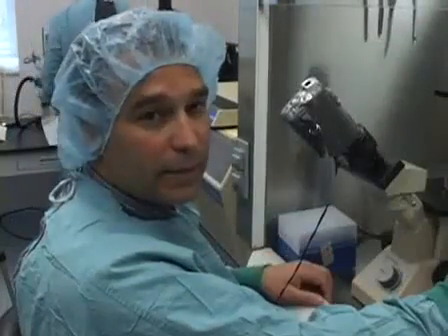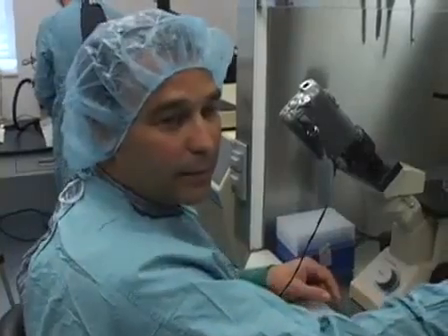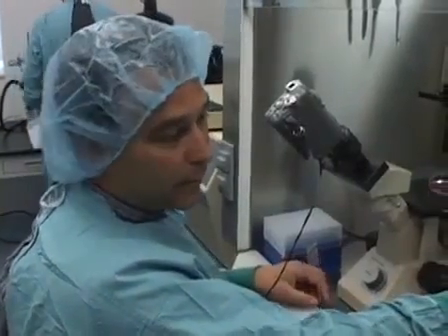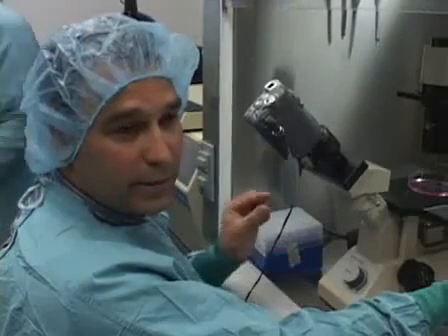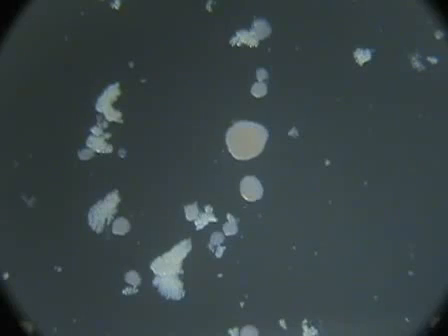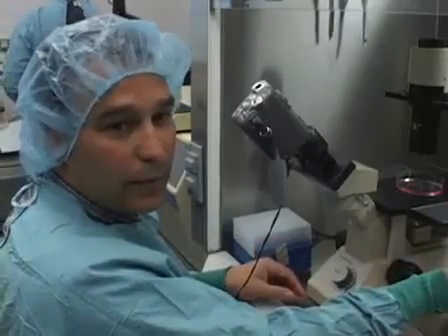Now we're ready to handpick the islets. I'm going to handpick the islets and count them while I'm sucking them up with the pipette. I'm going to leave behind any acinar tissue. I count the islets, put them in a microcentrifuge tube, and collect them for transplant.